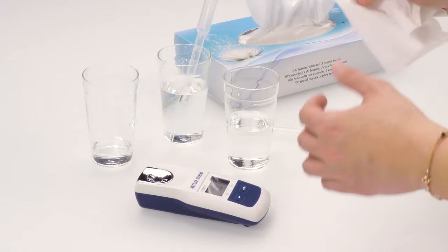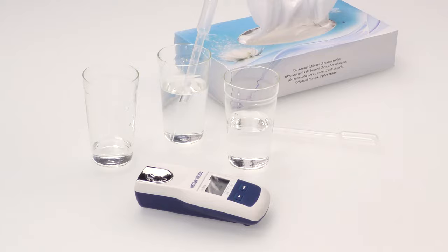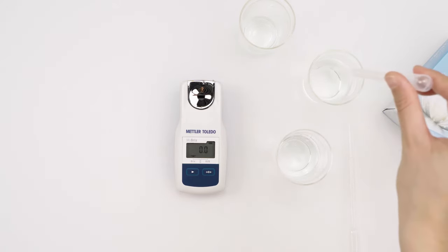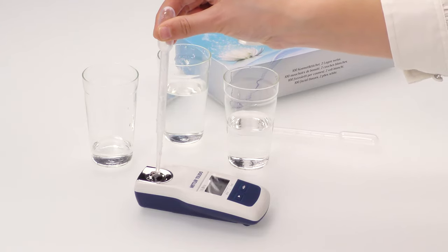With a lint-free tissue, dry the cell properly. For instrument verification, apply a sample of known concentration. We used a 10-degrees Brix solution.